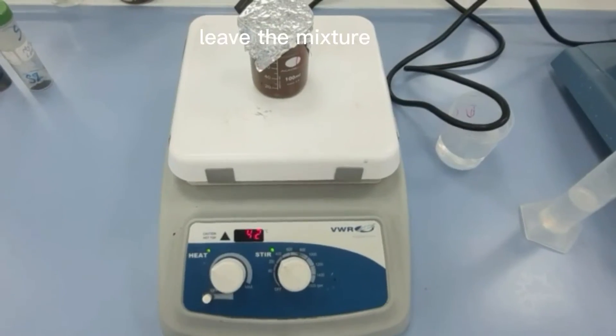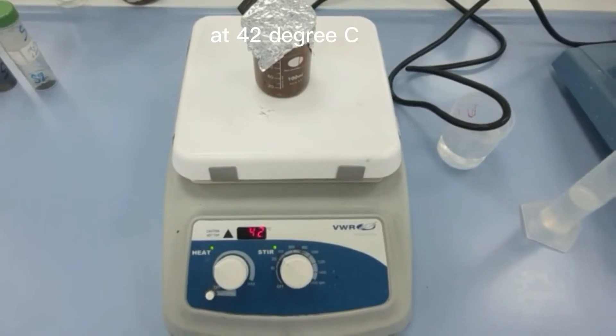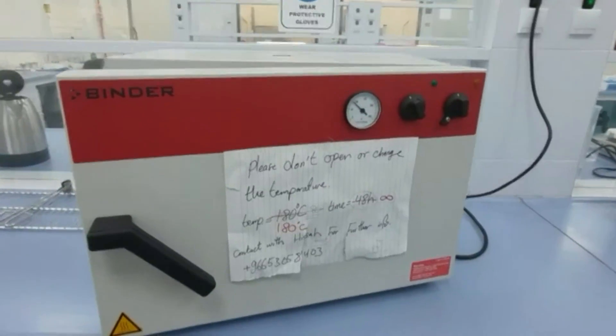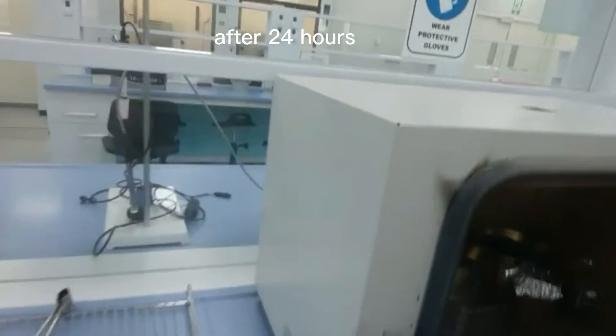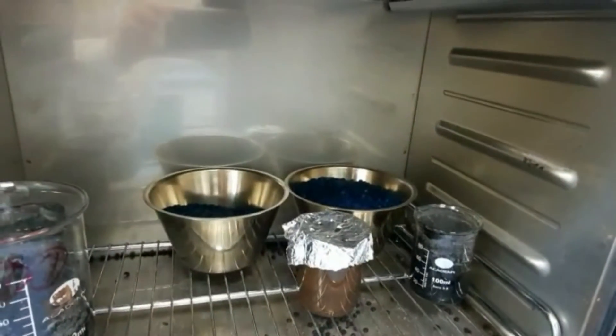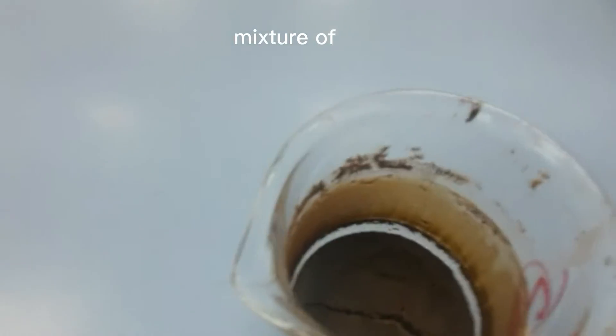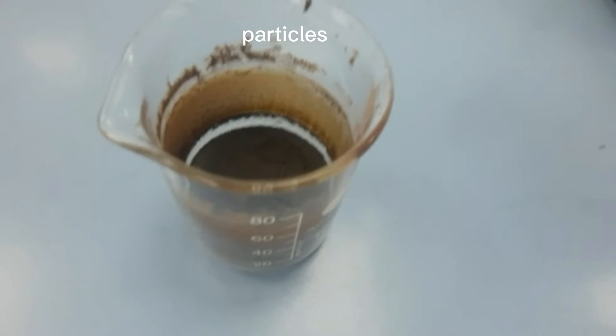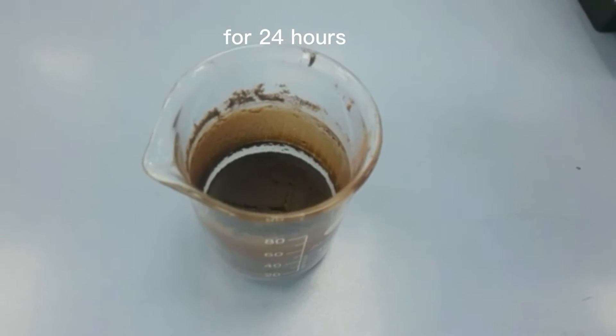Now leave the mixture for 24 hours at 40 degrees. After 24 hours, transfer the mixture into an oven. Final mixture of date palm and magnetic particles after drying for 24 hours.